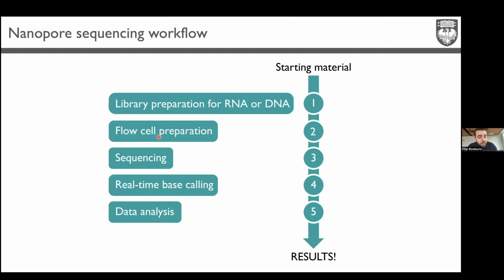So it's relatively way faster than Illumina. You don't need to care how many times you rotate up or down. You don't need to pay attention to what the concentration is, or whether you have too much or too little DNA or RNA. Compared to Illumina, there is flexibility, because if you have a small amount of input material, you will still have data, just less data, right? If you have too much material, you might not have full ligation, but you don't care because nanopores would not translocate those molecules.